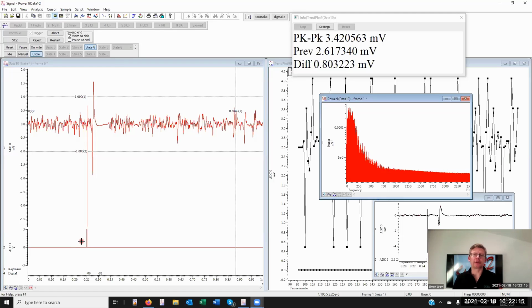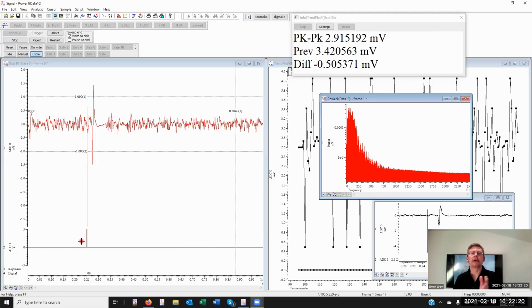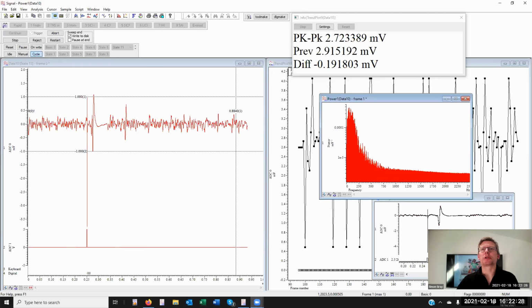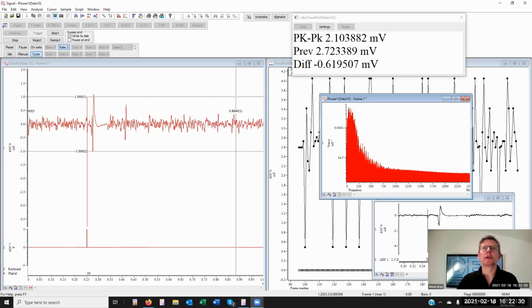So you could set a range that finds where the stimulus is. So cursor 0 or another cursor can be set to data points as its search mode. We will look at that. Okay, and there was a second question. I hope that's answered your question there.